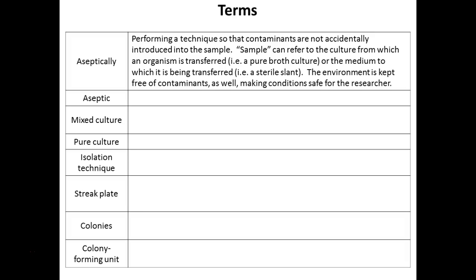So right now, you don't know what I gave you, but I know, right? Based on your number, what organism we gave you. So we don't want to contaminate it, because then you're going to get false results, right? Because you only want to test one organism. We don't want to contaminate our environment, right? Any of our stuff, especially anything that would leave this room, which is why we limit what comes in and what goes out. So that we want to maintain.